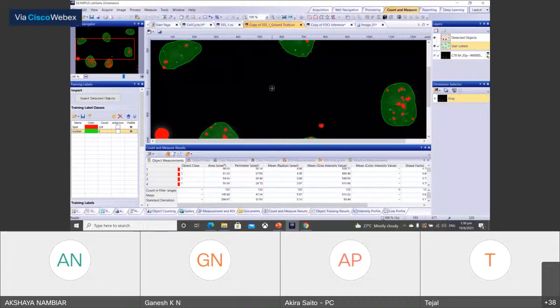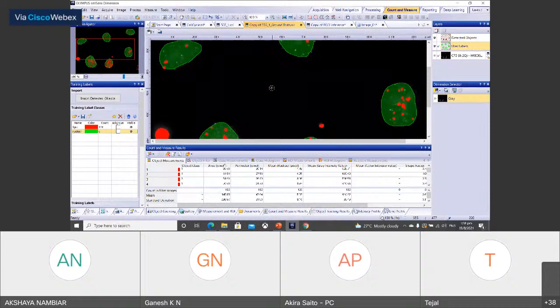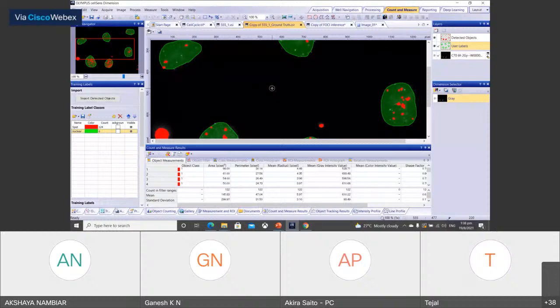And for the training itself, of course, we need several tens or several hundreds of images with ground truth to build the neural network. I just did this for one image, but it actually takes some time to label tens or hundreds of images to create the neural network.